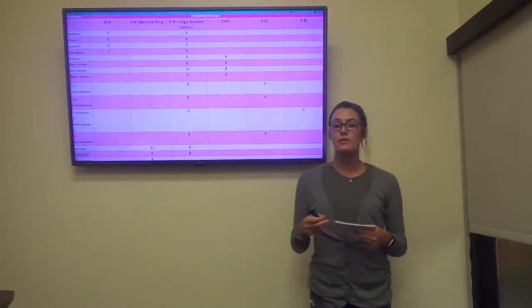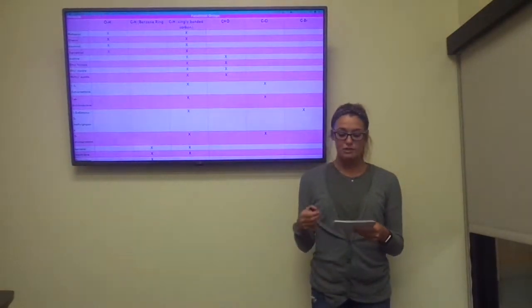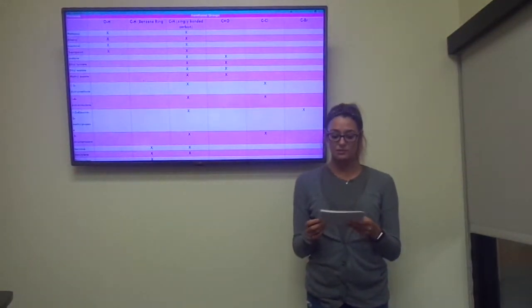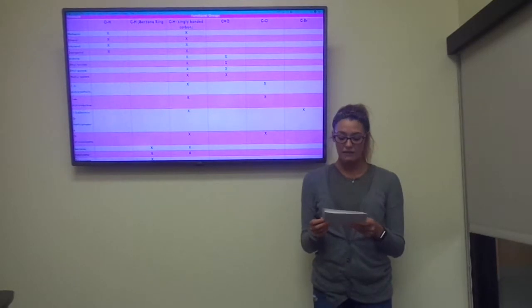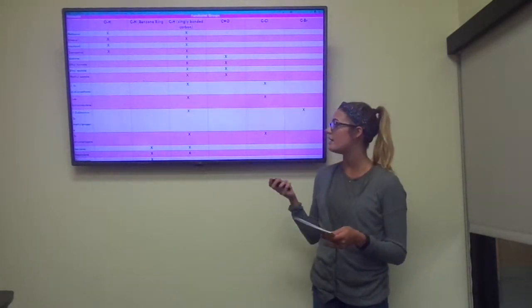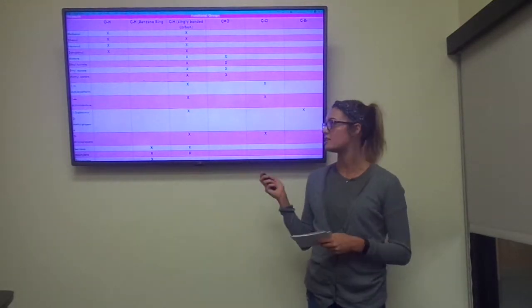This is a table that was filled out prior to the lab, using Lewis dot structures from each compound and documenting their known functional groups as a reference. Using the data on the peaks on this graph, we were able to identify functional groups given information by the lab manual once we got the scans back.